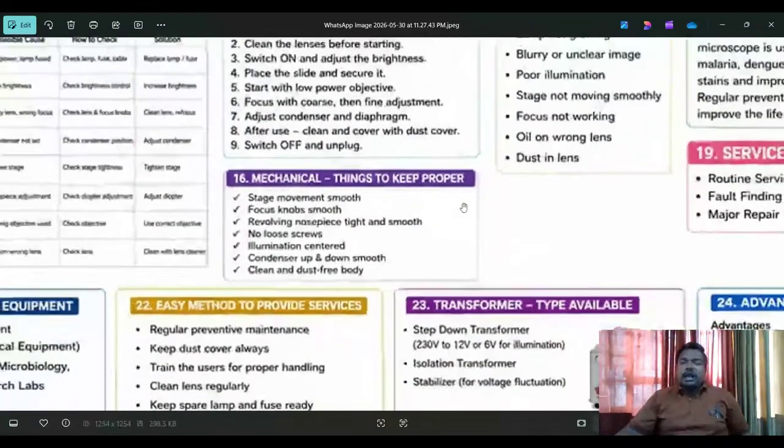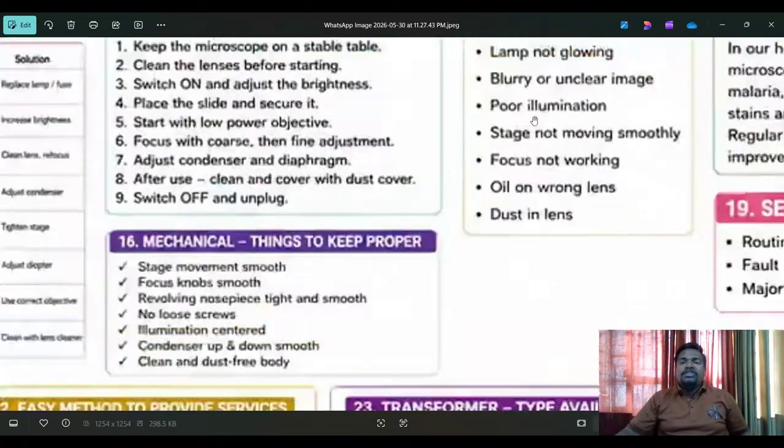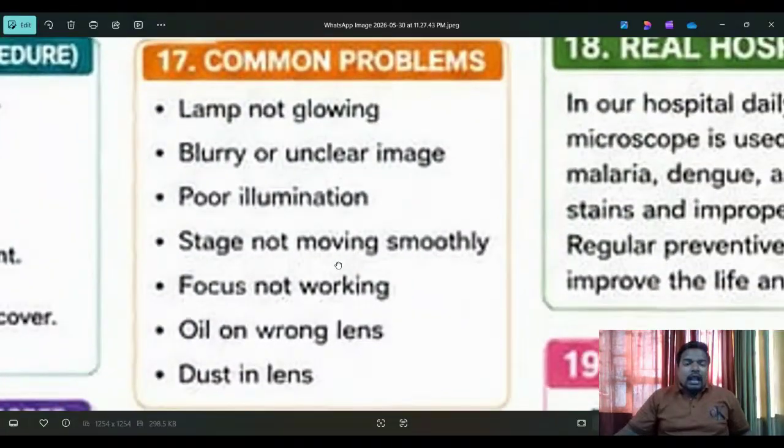Next, as per the technical way, see, all these things I have covered. Now going to the 17th point. Actually, for proper explanation purposes, I took it in this way.